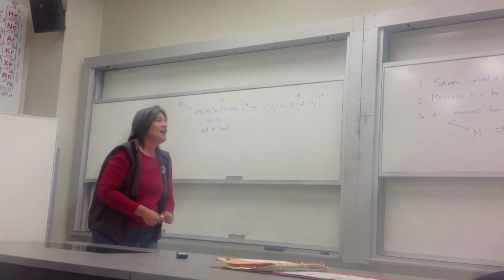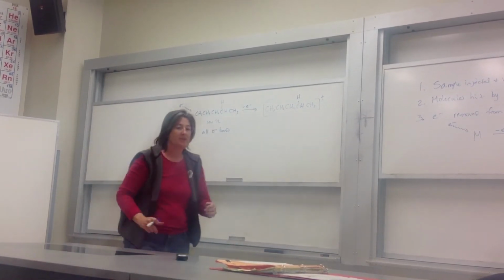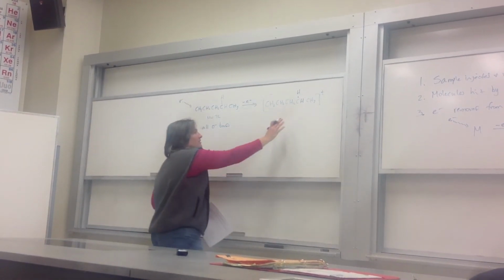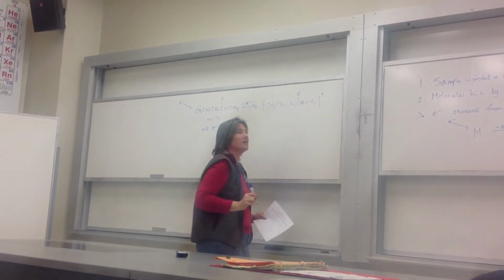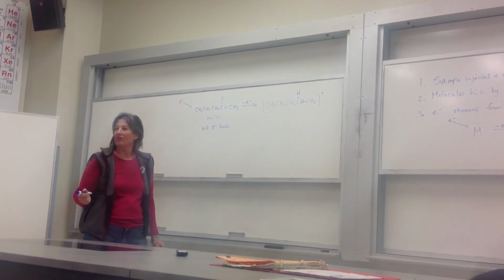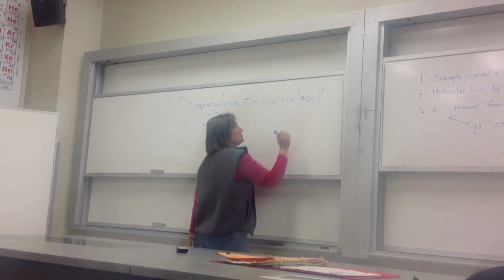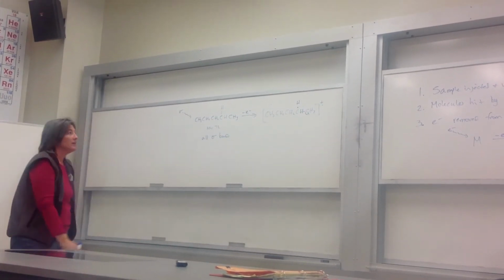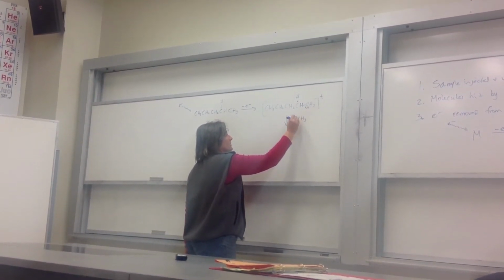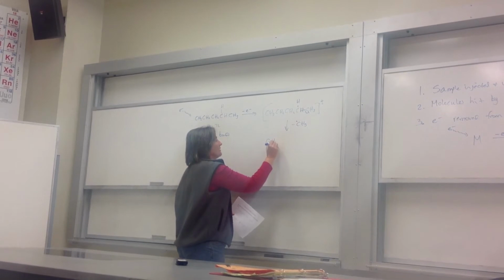So we rip that out, and then a number of things can occur. So looking mechanistically, the first thing that we'll do, looking at this guy, draw a little bond in right there. They show taking off a CH3 radical. So I'm going to take the electrons in this bond, and I'm going to do homolytic fission, because it's all radicals. And I'm going to lose a CH3 radical. And what that will leave me with is a carbocation on the other side.